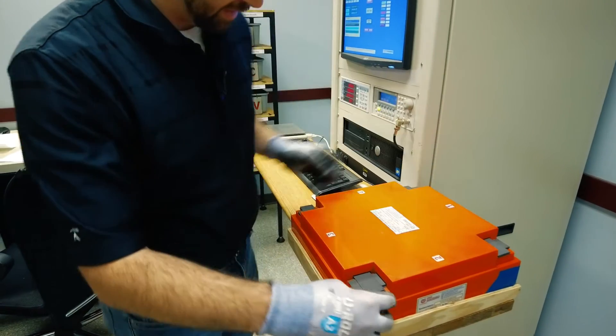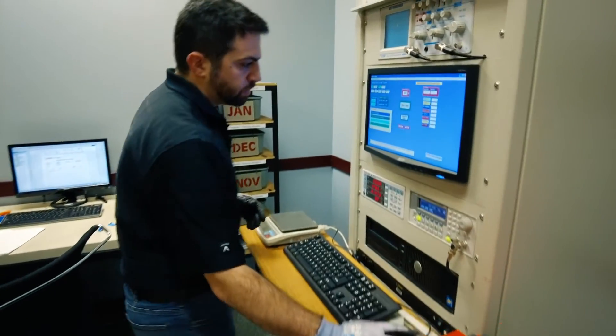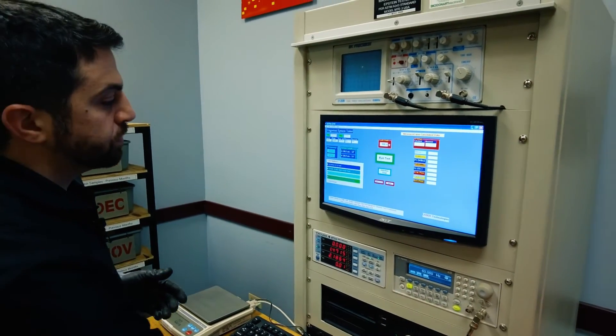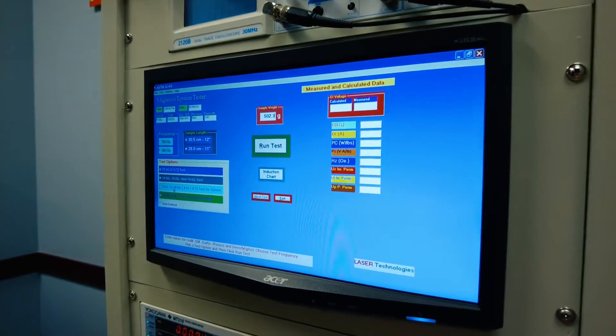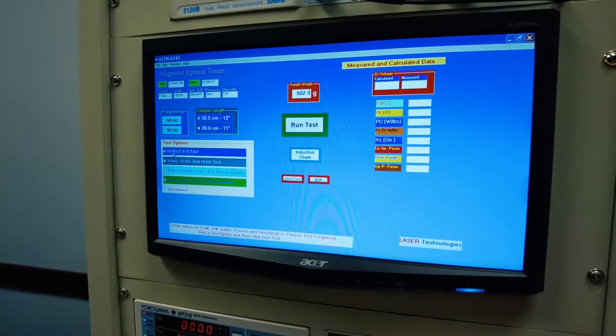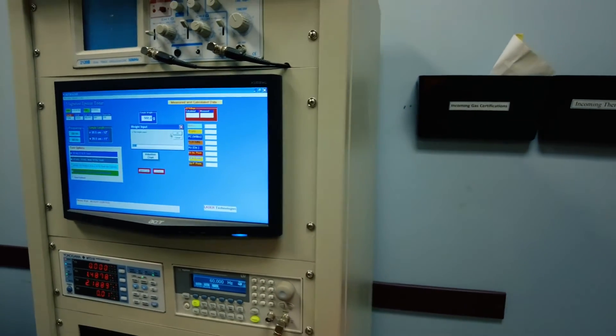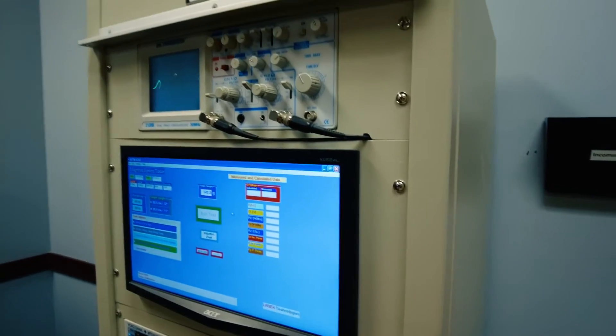Making sure everything is nicely aligned and seated correctly. We can test at both 50 and 60 Hertz and at any range between 4 kilogauss up to 18 kilogauss. For this test I'll pick the standard 15 kilogauss. My weight is already entered and my density is already entered, and the test will start running.